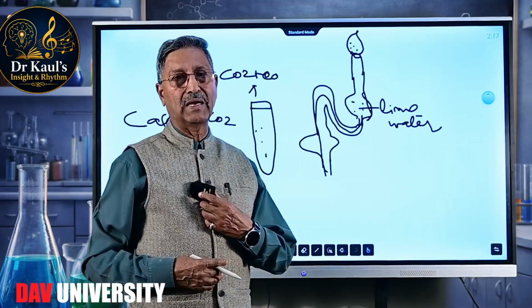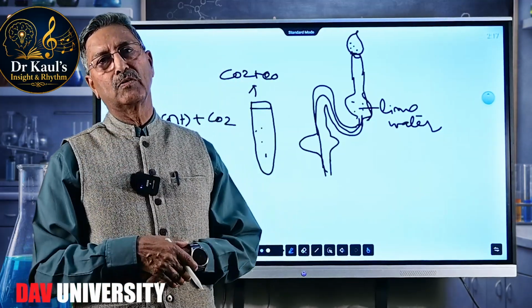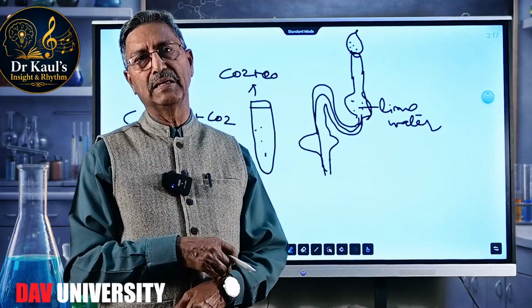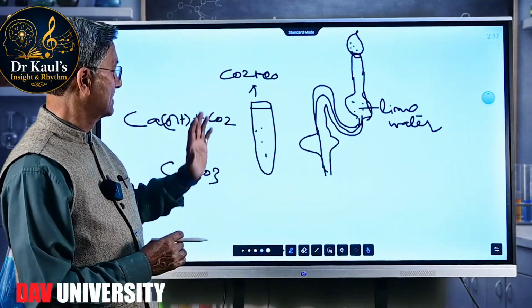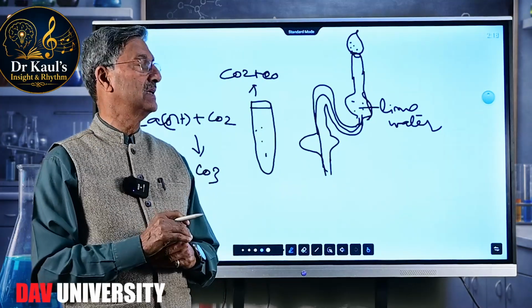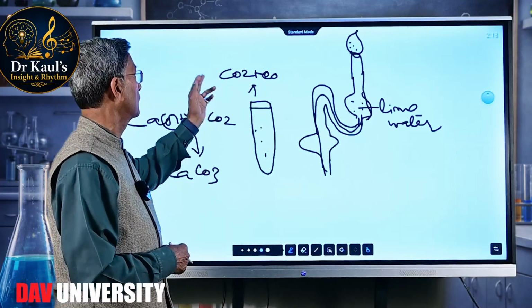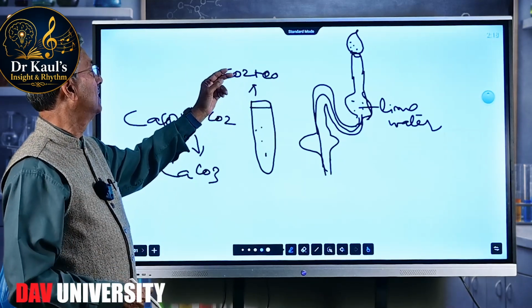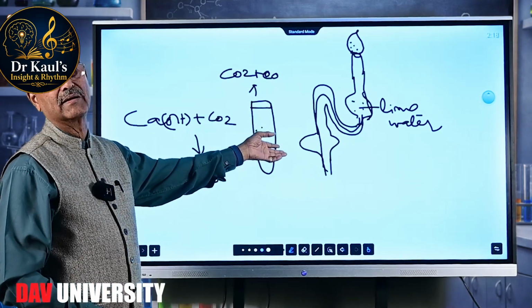As I told earlier, I have not touched upon fluorides, tartrate, arsenite, arsenates, etc. So up to this, for a beginner, the concentrated H₂SO₄ test covers the identification of chloride, bromide, iodide, nitrate, oxalate, and acetate.